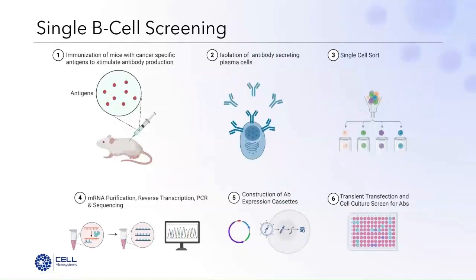So after the success of this hybridoma workflow, we wanted to turn our attention to single B-cell screening.